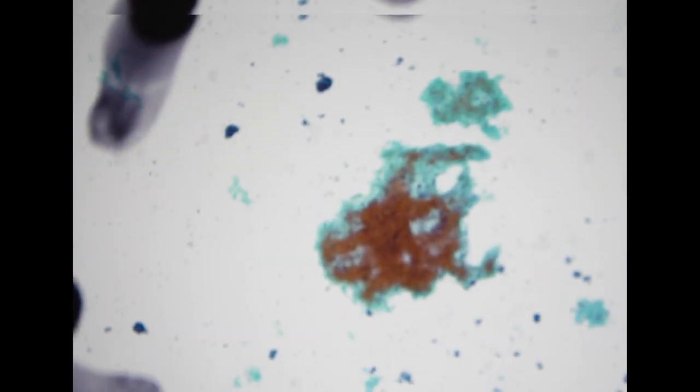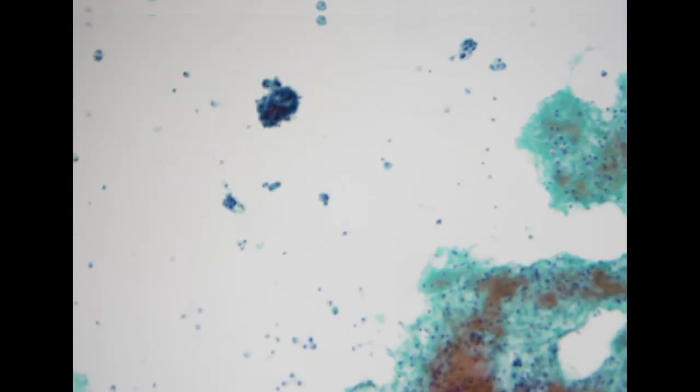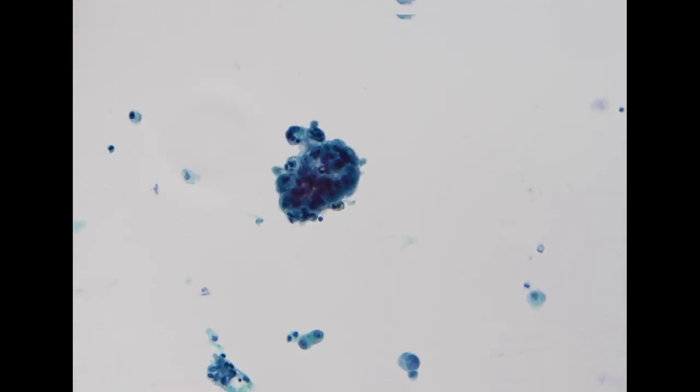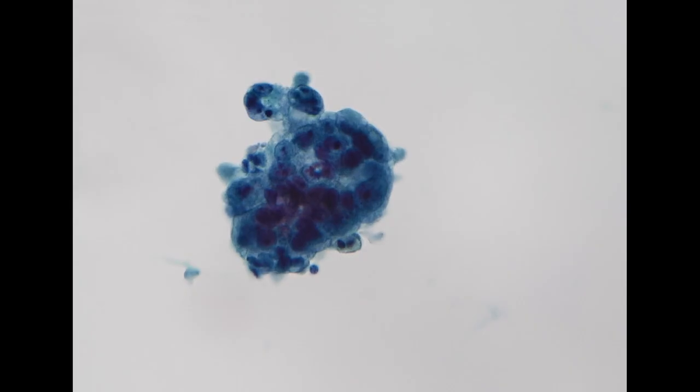So next specimen, an ascites specimen. The patient had a history of high-grade ovarian cancer. So this is very similar to the prior specimen. Instead, this is an ascites specimen, not peritoneal washing. But we can appreciate that in this specimen, we do see very high-grade adenocarcinoma.